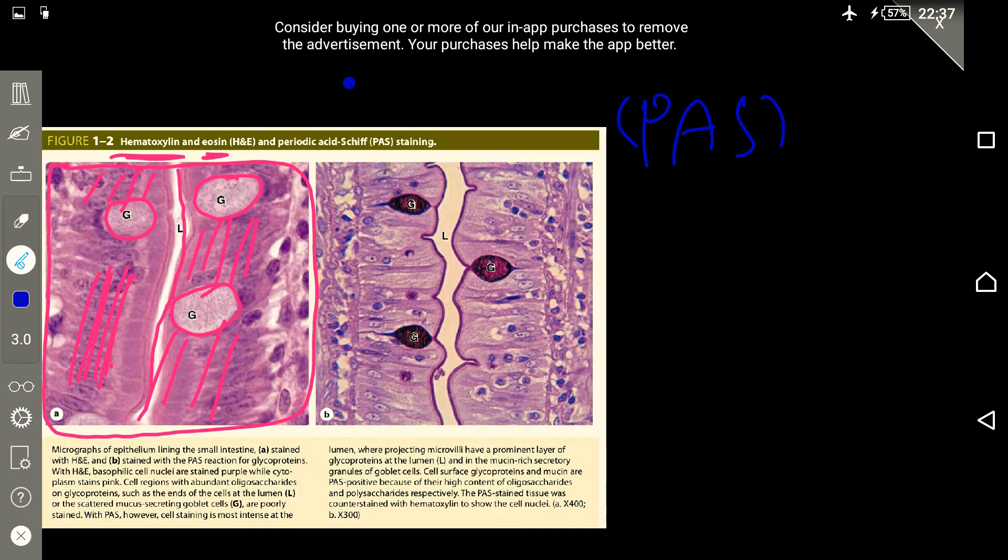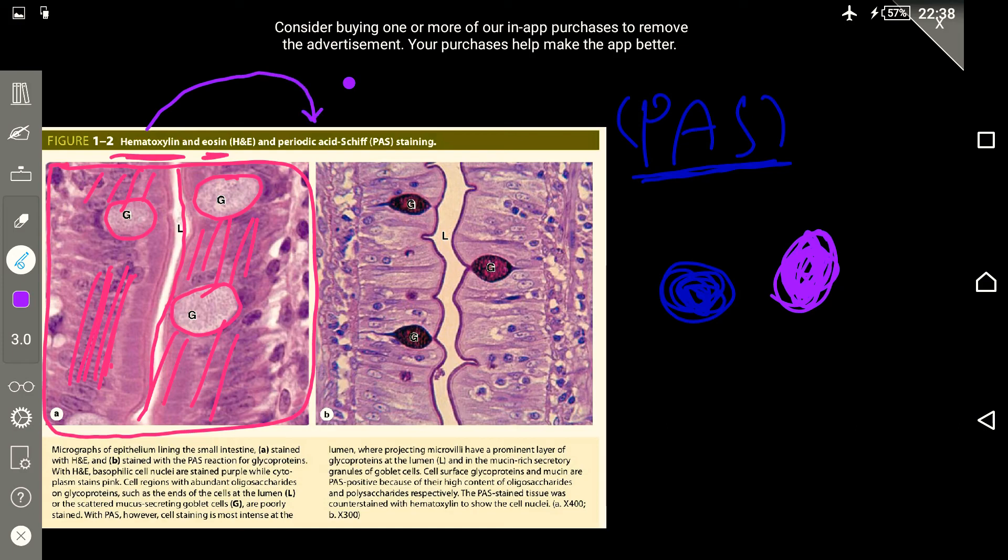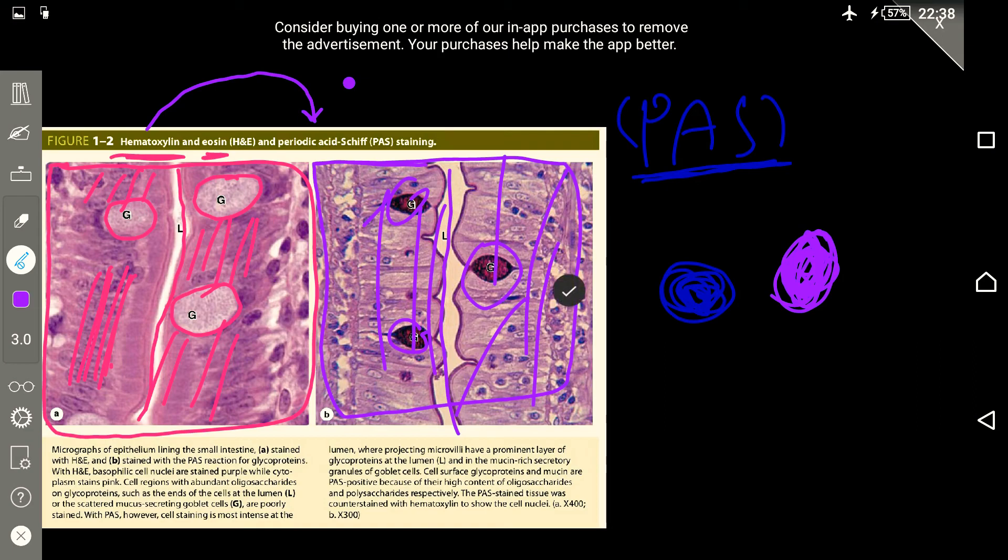This one is called periodic acid Schiff reaction or PAS reaction. This PAS reaction type is usually—since I've written it also in blue—the basophilic type, and the color it gives to the structures is going to be either dark blue or our beloved purple. So suppose only the hematoxylene portion is available in periodic acid Schiff staining. This second portion is the periodic acid Schiff staining, and as you see there is most abundantly the bluish or purplish colors here in the same tissue—the lumen, the goblet cells, and also the other cells lining the walls of the intestine.